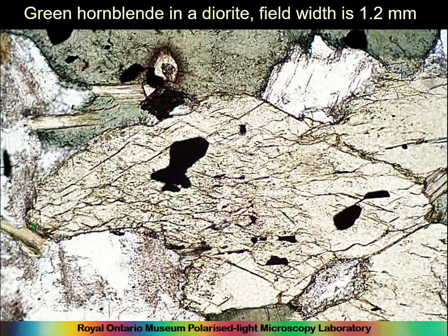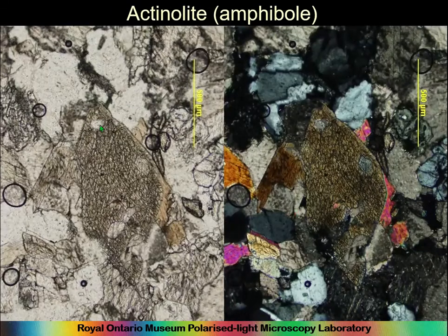Here we have a hornblende, and you can see the cleavages here at 120 degrees. And again, we're probably looking down the C-axis to see them this well developed. And here again, this is actinolite, another type of amphibole. And again, if you see something with these two cleavages at 120 degrees, you are looking at an amphibole. And if it's not green pleochroic, it's just another amphibole. So just look up which one it is, or just say it's an amphibole that is colorless, or yellowish green, or just green and not pleochroic or something. And so you just describe it.